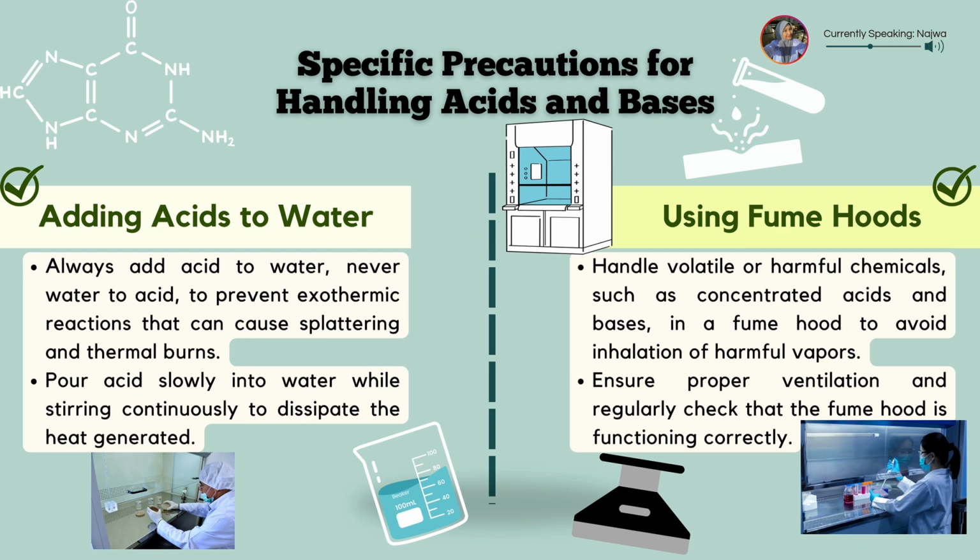When adding acids to water, always add acid to water first, never water to acid, to prevent exothermic reactions that can cause splattering and thermal burns. Then, pour acid slowly into water while stirring continuously to dissipate the heat generated.